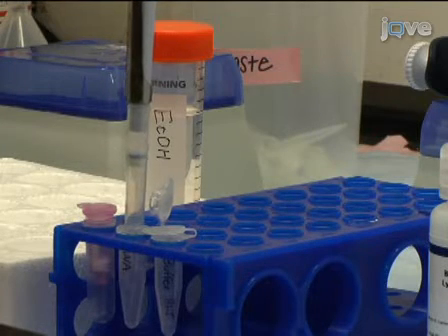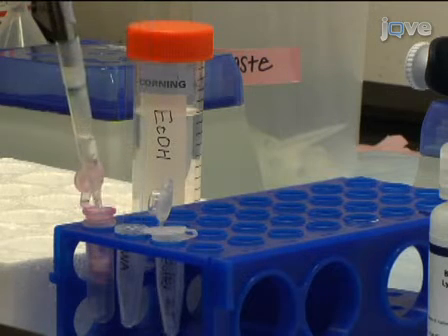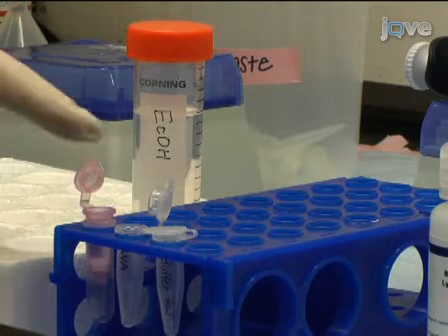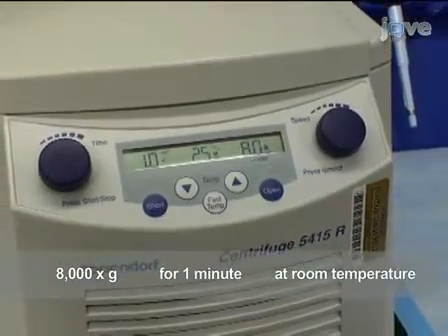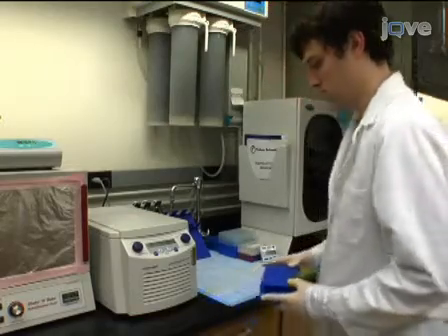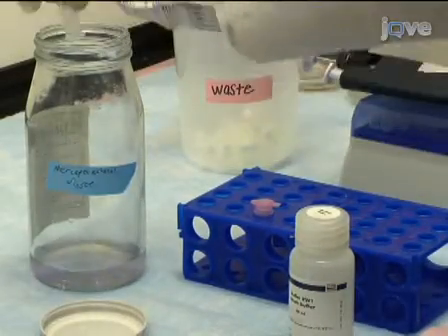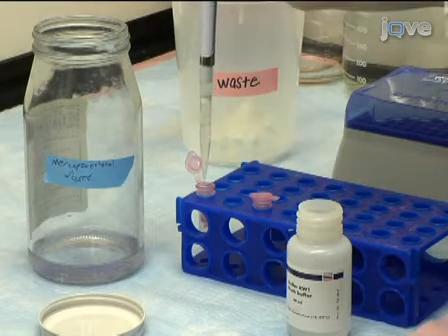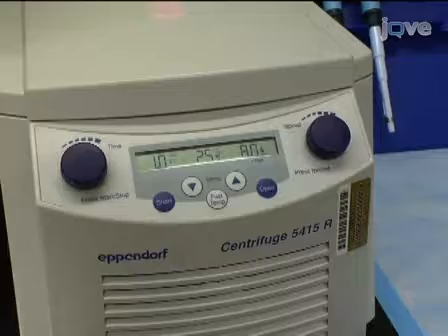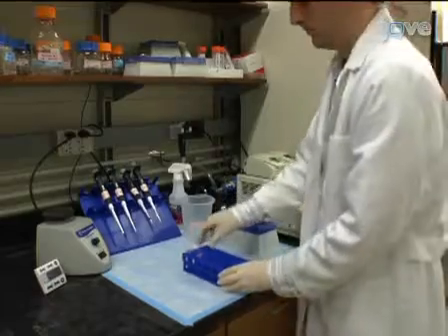Mix by pipetting up and down several times and transfer the entire sample onto an RNeasy column that is loaded into a 2 milliliter collection tube. Centrifuge at 8,000 g for 1 minute at room temperature. After centrifuging, discard the flow-through and add 700 microliters of buffer RW1 to the spin column. Centrifuge again at 8,000 g for 1 minute and discard the flow-through.